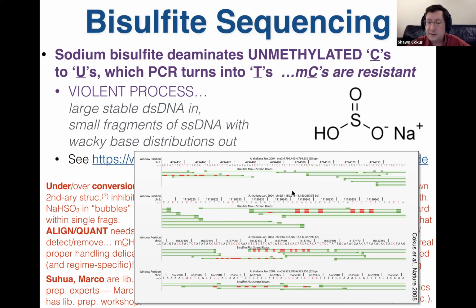And what you see is that the methylation is not vertical, it's horizontal, meaning that the methylation is all coming from a subset of the reads. Certain reads are all methylated or not, and it's not distributed randomly across the reads. So even though the level is nominally 50% at some of these sites, that's all coming from the same 50% of the reads and not a different 50% as you look site to site. That's a flag that maybe this is going on. So if you're looking at alignments in detail and you see something like this, you might start to wonder if you've got non-conversion.